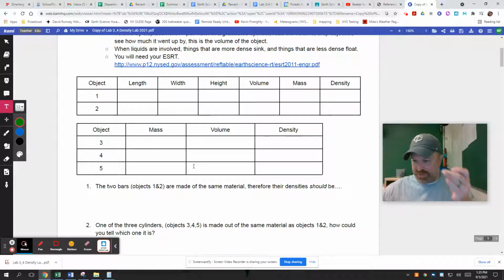Hey, Mr. F, these all look about the same. So if I do it once, I can just count those, right? No. You want to practice safe science. Each one might have little individual variables that maybe it's off by a milliliter. Maybe that matters. Okay, don't be lazy. Check all 3. You'll be good.